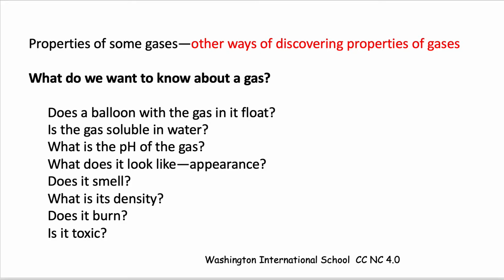If the gas was in a balloon, would the balloon float? Is the gas soluble in water? What's the pH? What's its appearance? Does it smell? What's its density? Is it flammable? And is it poisonous?